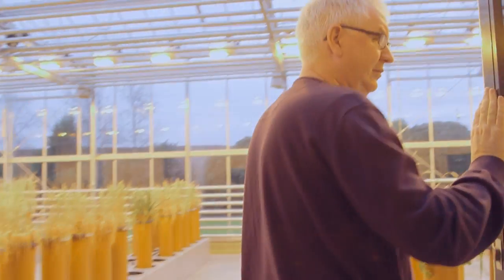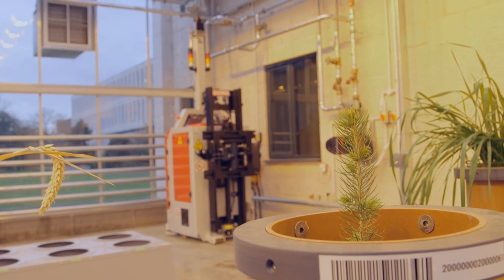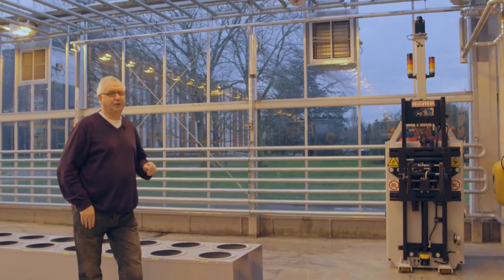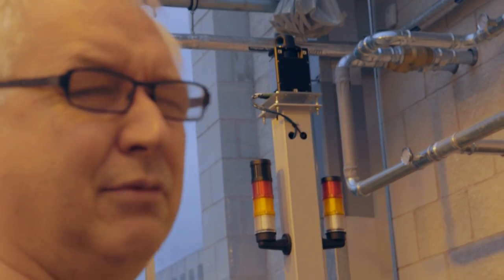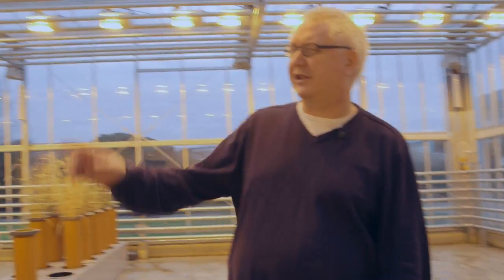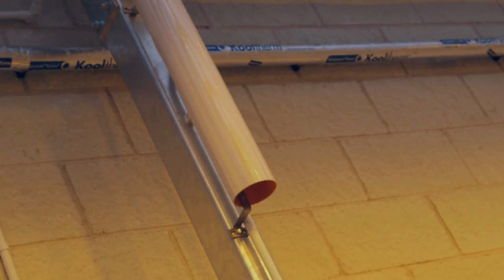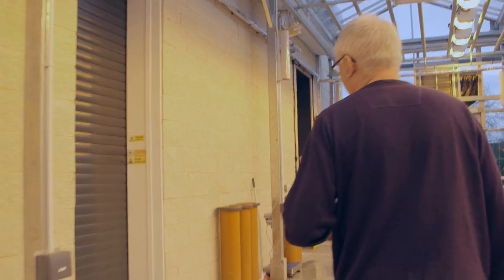This is a standard glasshouse. We grow our plants in these containers in here. They're laid out neatly in rows because the way that we transport them is we have a laser-guided vehicle over here. On top of the vehicle is a laser — the top spins around. There are reflectors placed at particular points around the glasshouse; you can see the cylindrical objects fastened to the walls. They're markers. The robot can measure the reflection of the laser off those markers and know where it is, and so it can navigate autonomously around and pick up whichever sample we're interested in.